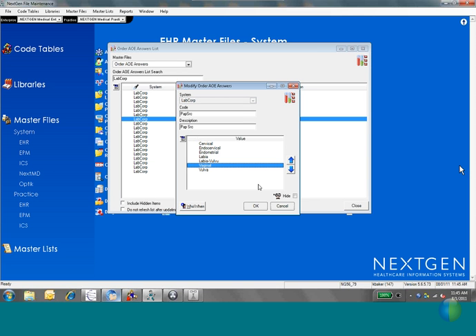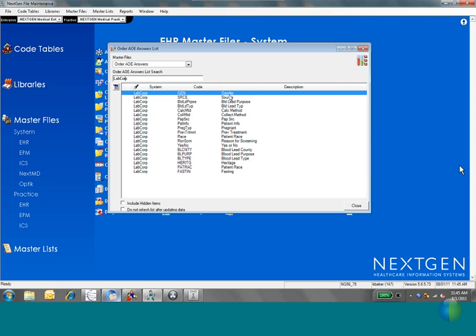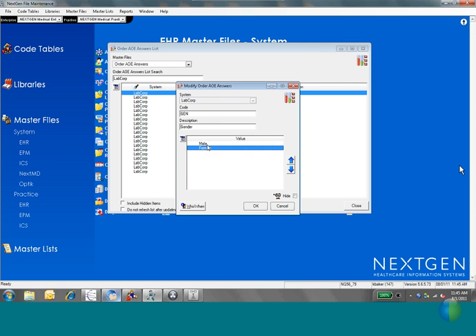So you can see that listed there. Other things, like gender, for example. Yeah, you can make a pick list out of gender, but you could also link it to a template because you know that the gender is already captured in the templates. So some of the times when they give you possible answers, you actually might be able to avoid the whole pick list option and let the answer just be completed for them from the template.